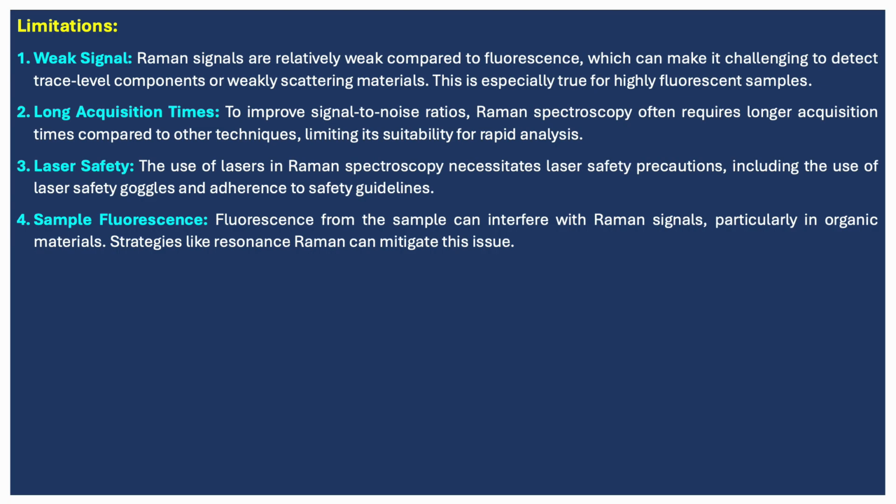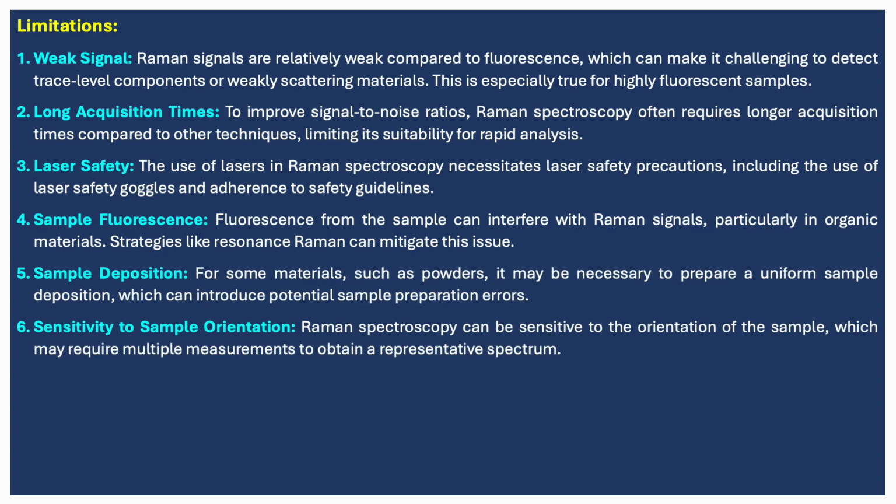Followed by, fluorescence from the sample can interfere with the Raman signal, particularly in organic material. Strategies like resonance Raman can mitigate these issues. For some materials such as powder, it may be necessary to prepare a uniform sample deposition, which can introduce potential sample preparation errors.